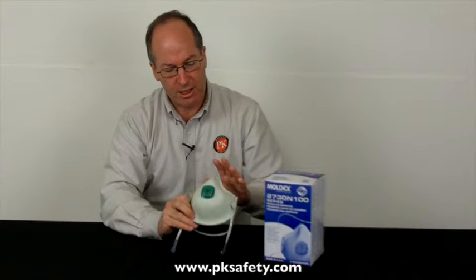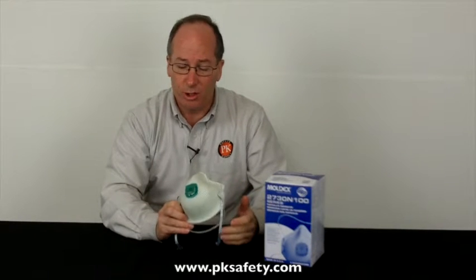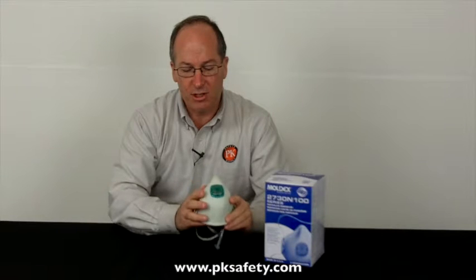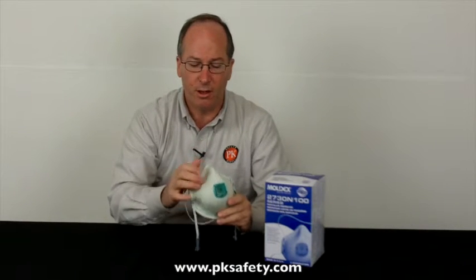This mask comes in a box of five. There are instructions for fitting on the box. The features that make this kind of unusual are the mesh outside — it's common to Moldex masks. It gives it some shape, and it means it has a built-in nose bridge that's molded in. There's no metal nose piece.